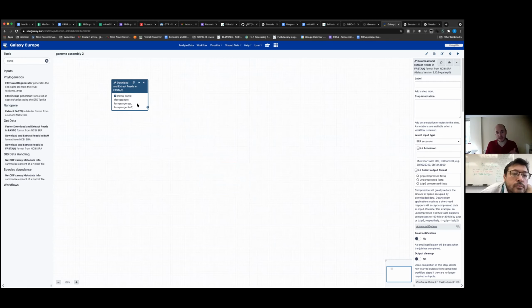It's the interface with the Sequence Read Archive. Fasterq-dump was developed a bit later to be faster. In my experience, it's not a very efficient tool. Sometimes it gets stuck, it complains. But overall, especially if you can parallelize the download, it's actually not too bad.